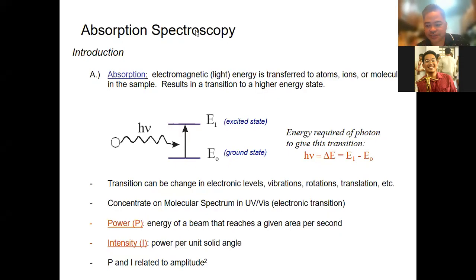So I'm going to discuss the general technique. Okay, maybe this is just a review for you. And while we're looking at the parts, you will see what we discussed on the angle. Okay, so the first thing that we're going to discuss, at least for today, since we can't finish the whole session, is what we call absorption spectroscopy.